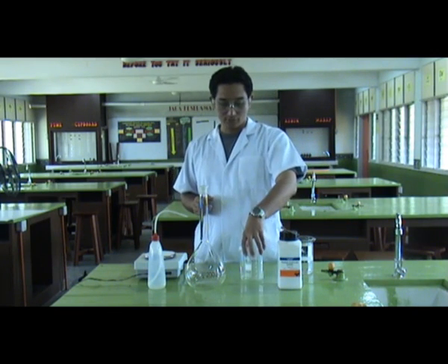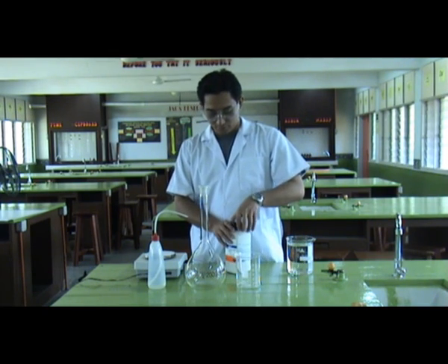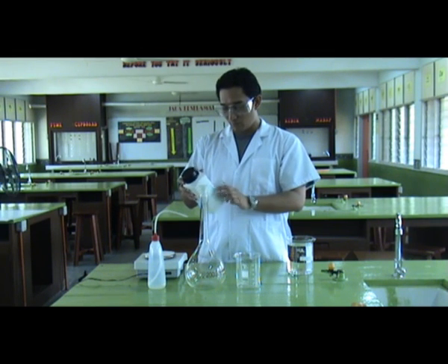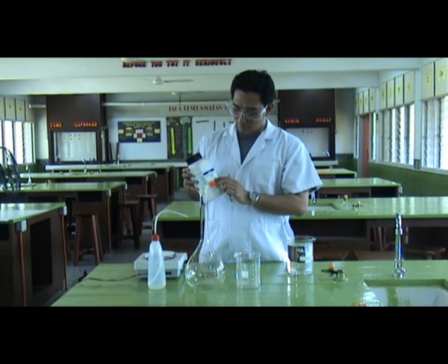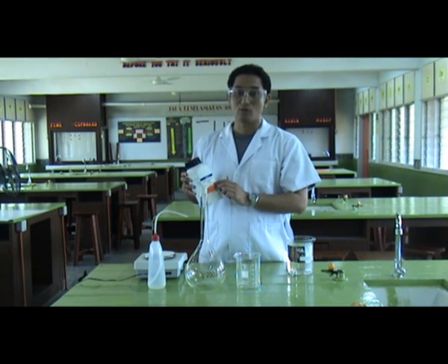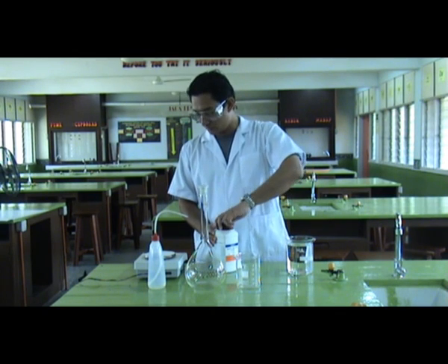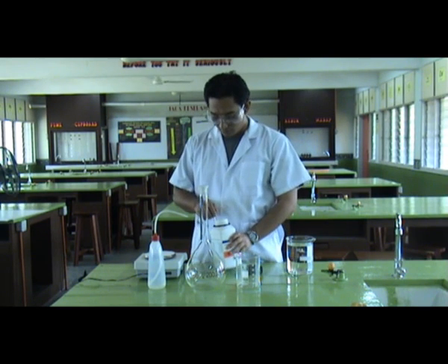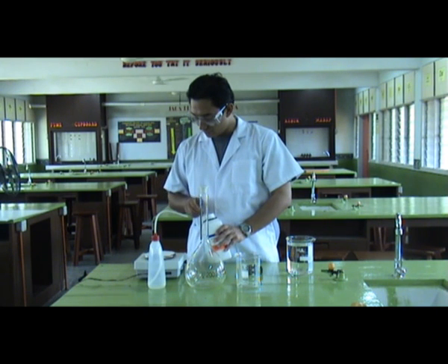The first thing we need to do is measure about 40 grams of sodium hydroxide. Because on the bottle it says that we need to use about 40 grams per mole of sodium hydroxide to make a one molar solution. We carefully measure 40 grams of sodium hydroxide.